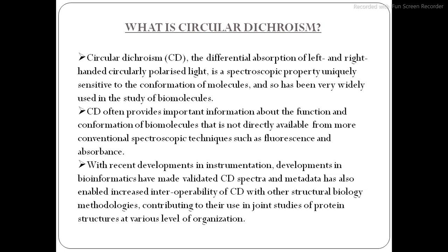In recent years, circular dichroism studies are also used with other structural biology techniques such as X-ray crystallography, neutron scattering, NMR spectroscopy, molecular dynamics, and computational modeling, due to new developments in circular dichroism data accessibility and bioinformatics software.